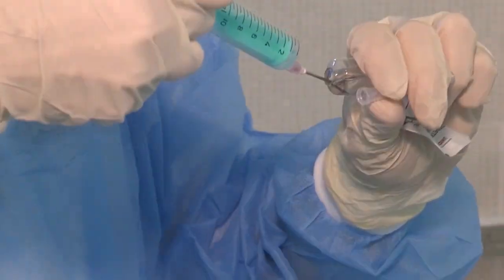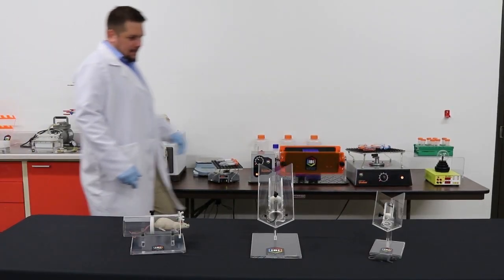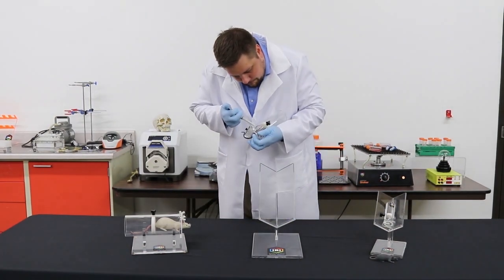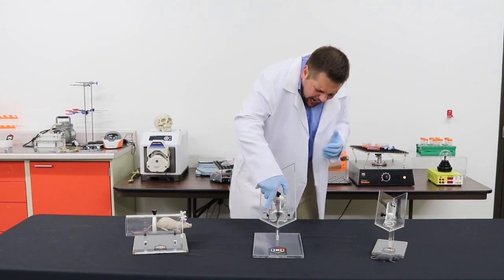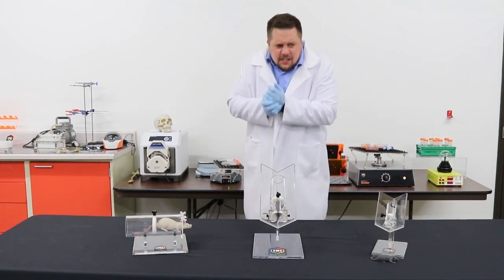Making injections? A quarter inch access ports on the sides of the unit permit access for subcutaneous inject— Oh no. Oh no. Not again.